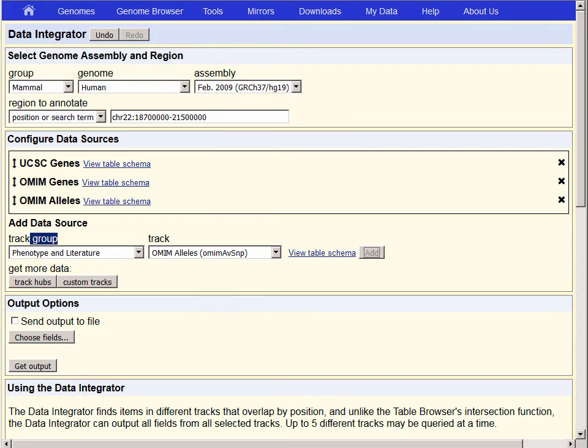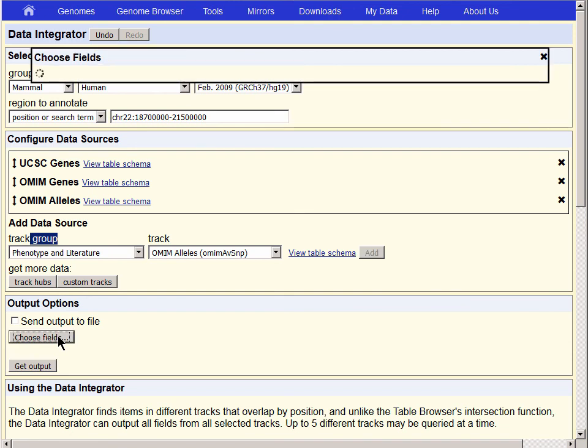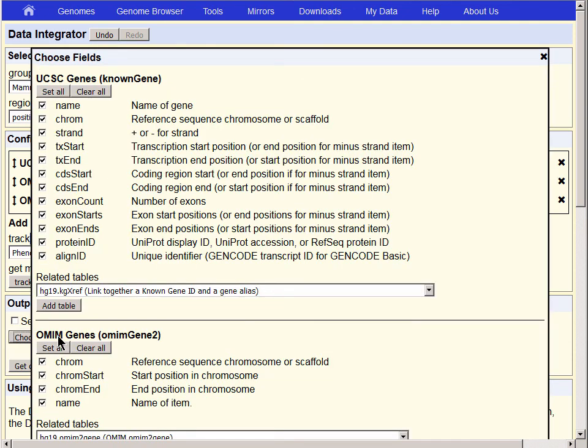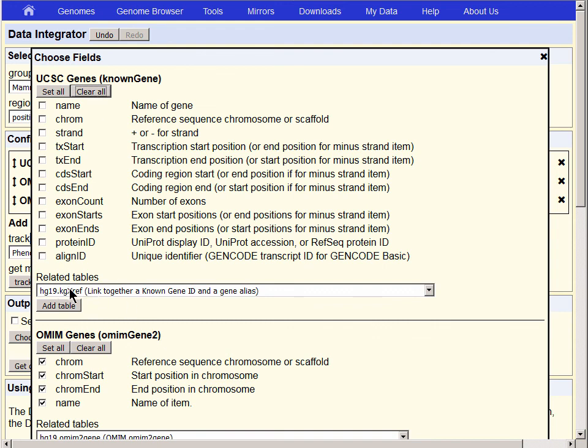We will use the Choose Fields button to allow us to pick out which bits of data from these three tables we're interested in, as well as some related tables. We'll start with UCSC Genes, and we'll simply clear all of these data fields. We'll add in the related table, the KG cross-reference table.